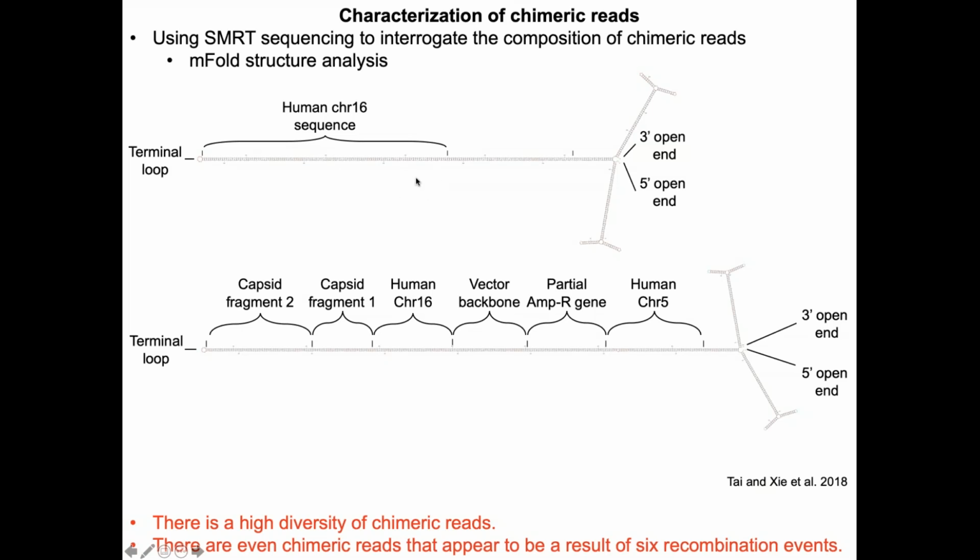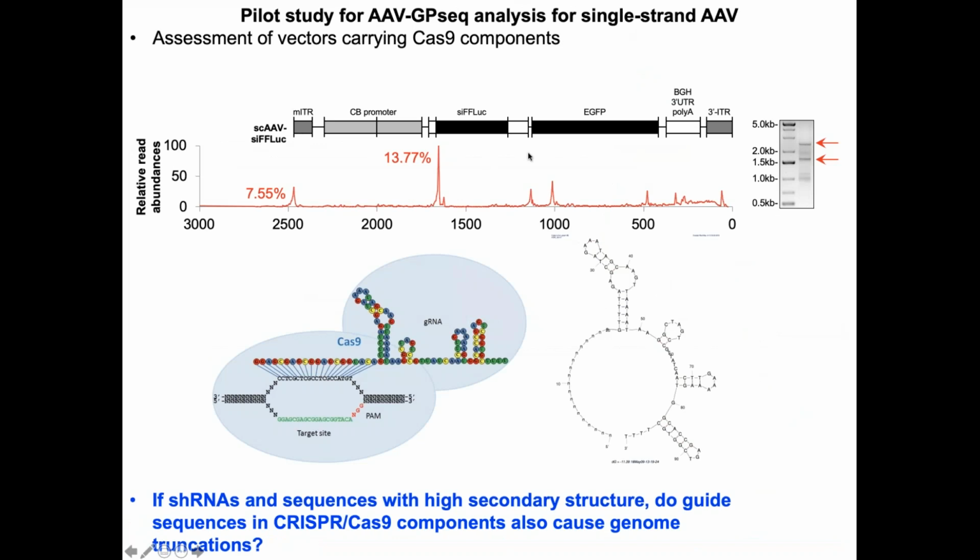And although these types of methodologies are able to identify these species, know that these really are detected at very low percentages. But on the flip side, they do have some mode to persist in the host cell once they get into the nucleus.